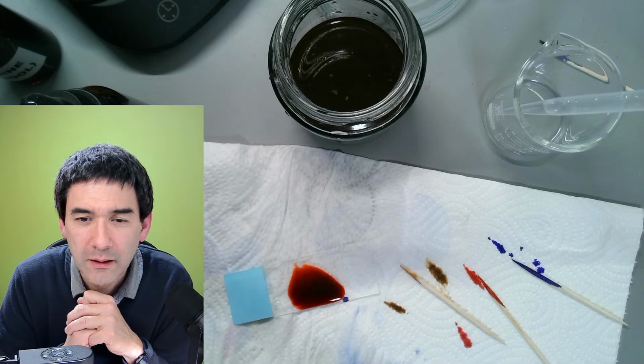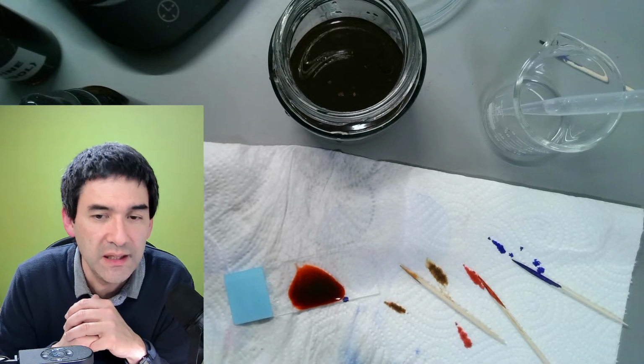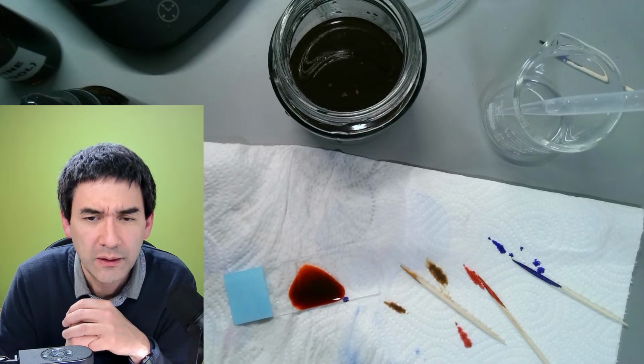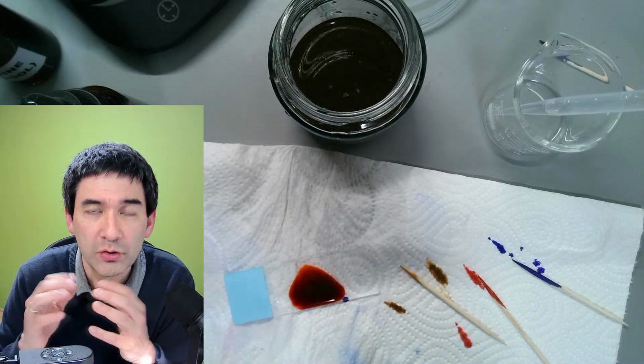Before I do the following, is the mucus protein based? I would say mucus in nature very often does contain protein or polysaccharides. In the case of human mucus, I don't know. But a lot of slime and mucus are long chains of polysaccharides.